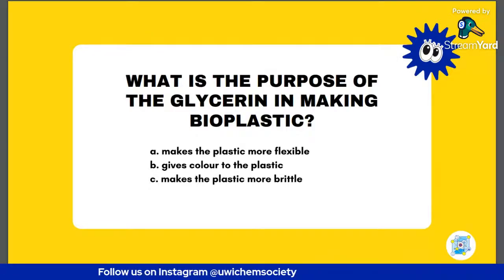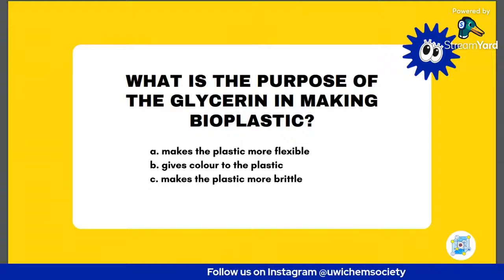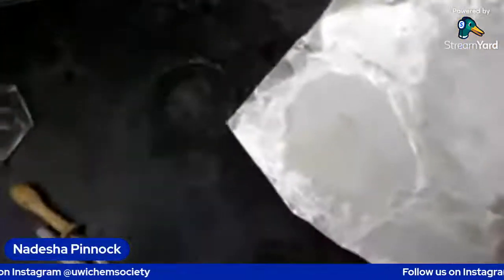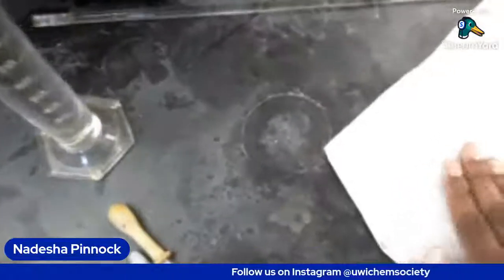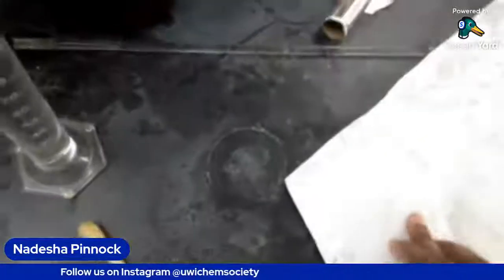So with my plastic, I had added 5 mils of glycerin versus Javon, who had added 7.5 mils. So his one is softer and this one is a bit harder and thicker. And also I allowed mine to get a lot thicker.